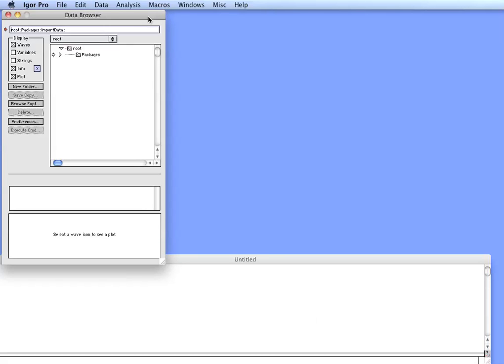Using Modeling 2 package in IRENA. In this movie I will show you how to use Modeling 2 package or tool in IRENA.